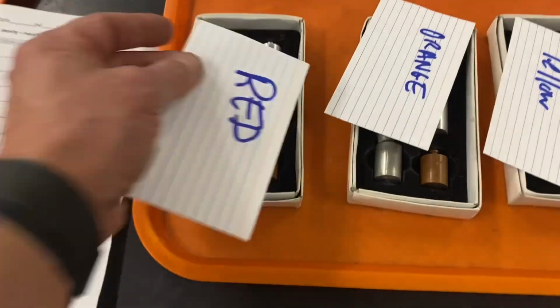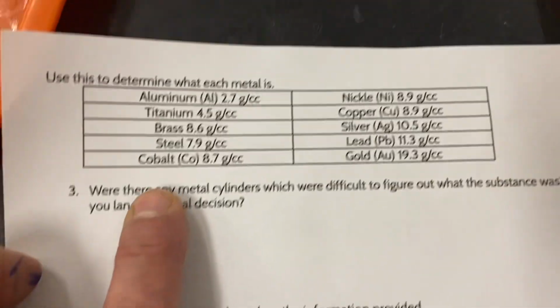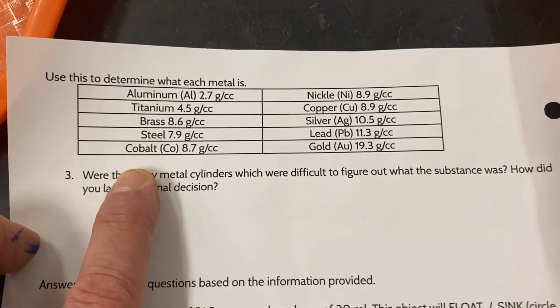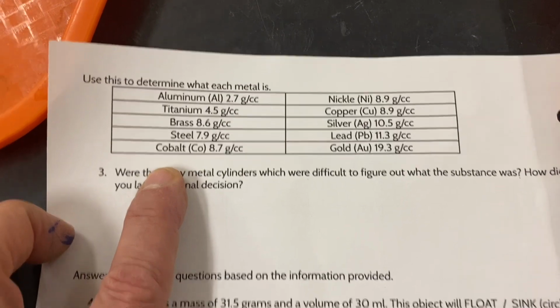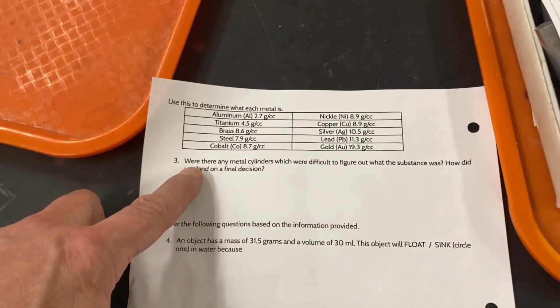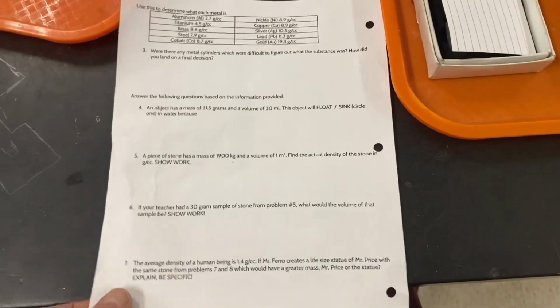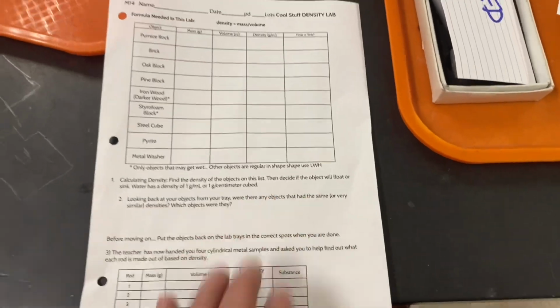So find the density of them, and then on this side, you're going to try to identify the metal, because metals have characteristic densities. So you might be able to find out what the density of the objects are. Okay? Once that's done, you can sort of work your way through the questions, and you should be able to answer these sorts of questions.